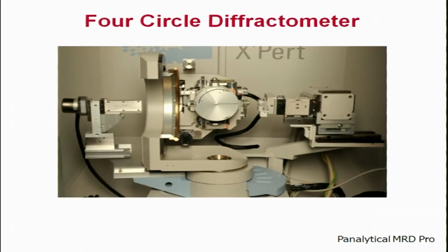In a more advanced diffractometer, you have a 4 circle diffractometer. You have the sample rotating within this plane, and the cradle rotating. This is phi, this is psi, and then the machine rotates in 2 theta. The sample can also rotate along its own axis within the 2 theta plane. This is omega. Omega is used for rocking curve analysis, and omega is basically half of 2 theta.